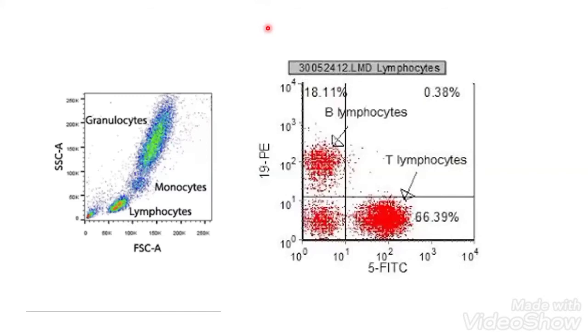So people say that Chyawanprash is an immunomodulator, right? But nobody tests that. Nobody checks that. That herbal extract is known to boost the immune response. But how to check that? It's very good. I take PBMCs out of my blood.